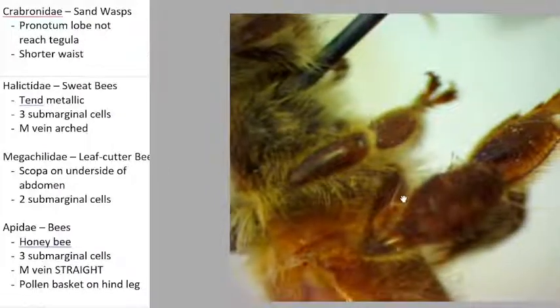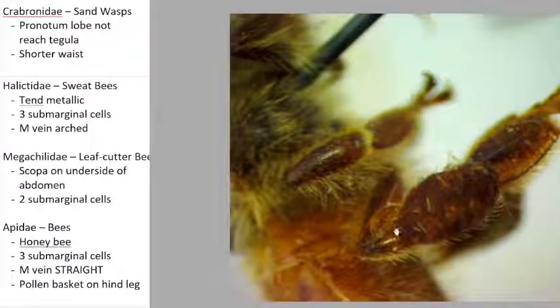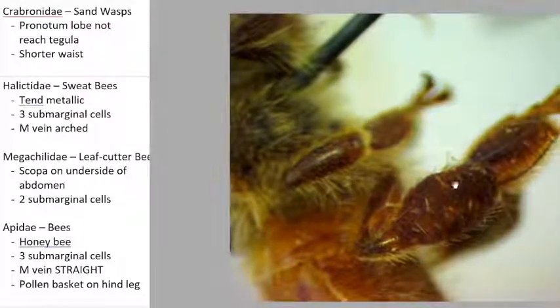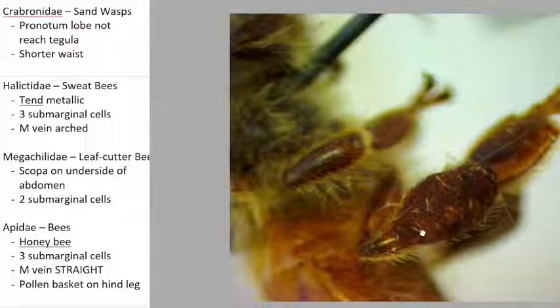All right, so right here we are looking at the hind leg, and this right here is actually a large chunk of pollen that is still stuck to the hind leg. I think that that's really cool. I would never clean these off. I think that you can actually sample this and determine what types of flowers and things that the honeybee was sampling from, which is kind of cool.